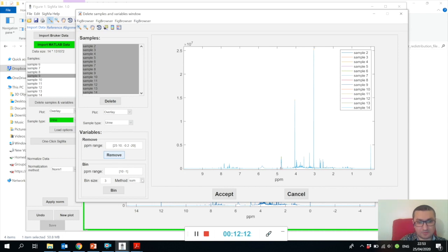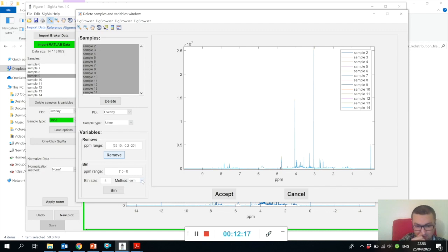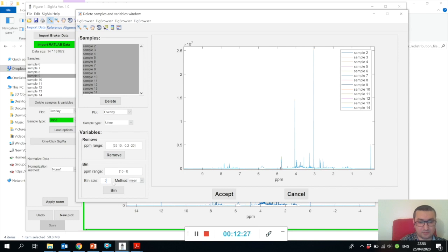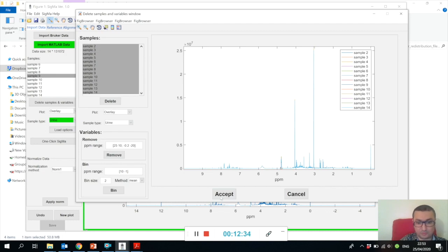Do we need all of this NMR spectral region? If not, you just press Remove. Sometimes we work with very large NMR spectra and in order to speed up a little bit, we can consider binning the NMR spectra.